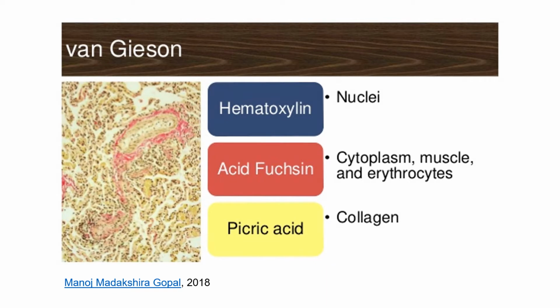Okay, so this is an example of a staining procedure, and this is called Van Gieson. I don't know the correct pronunciation, but take note this procedure uses three types of stains. Here they have hematoxylin, which stains the nucleus and it appears bluish. The dotted structure here, or the dark structure, those are actually bluish when we magnify this tissue.